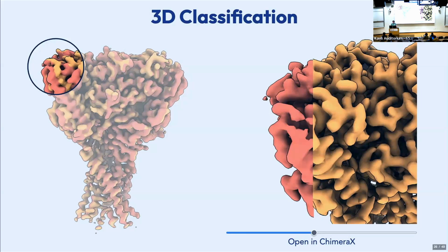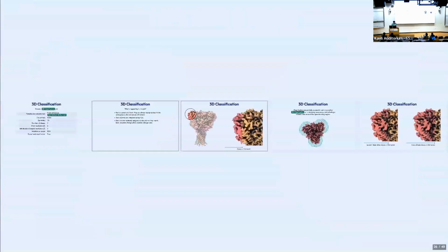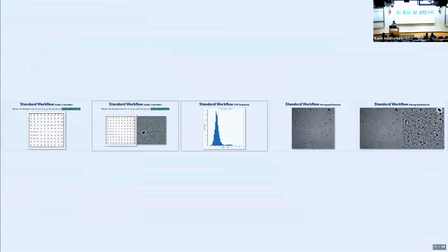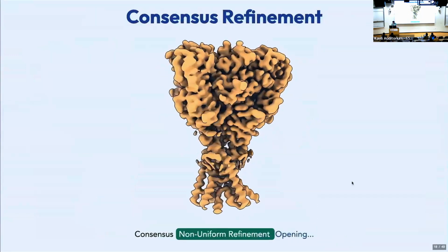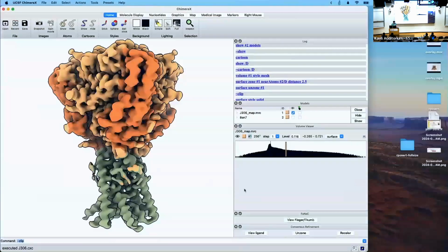Sorry, the one was, how to create and label different domains in cryo-EM. It looks really nice to have clickable domain labels in ChimeraX. Oh yeah, okay, I can talk about that for sure. Let's go back to the one I had yesterday too. I think this has it. To do this, there's a few things.